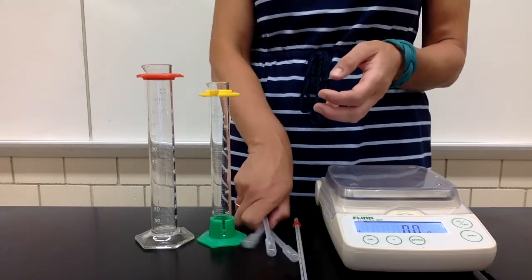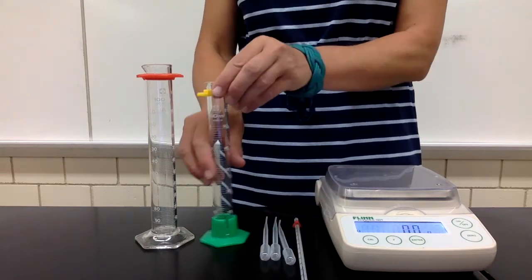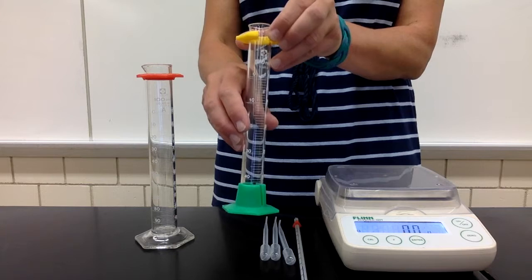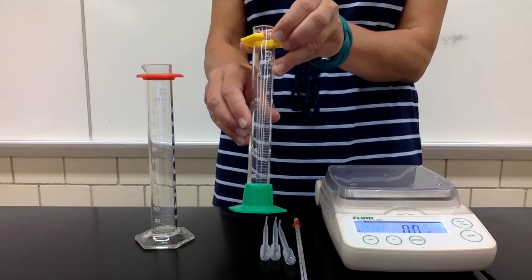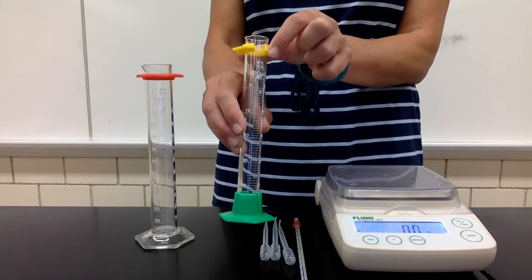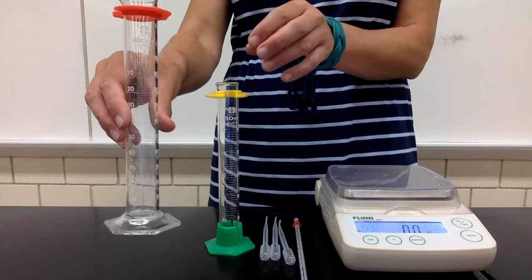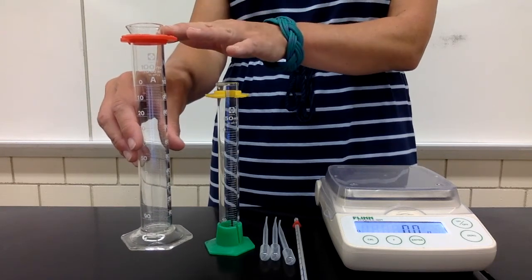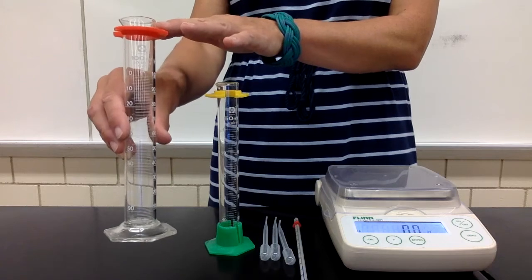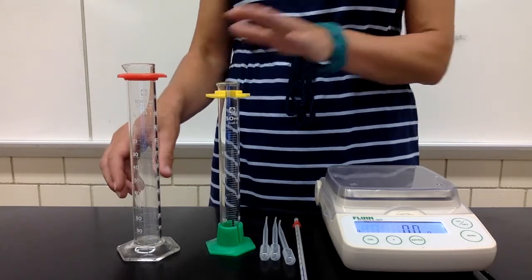We have some small plastic pipettes for transferring liquids. We have a 50 milliliter graduated cylinder where each line is 1 milliliter of liquid volume, and the little plastic disc is there to protect it if it tips over so it doesn't break. And this is a 100 milliliter graduated cylinder for measuring liquid volume, and each line on this piece of equipment is 1 milliliter of liquid volume.